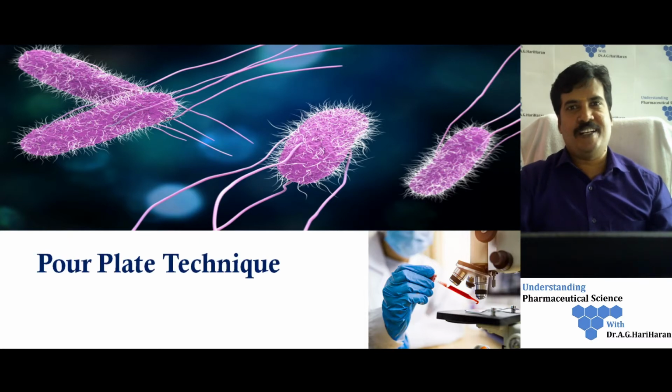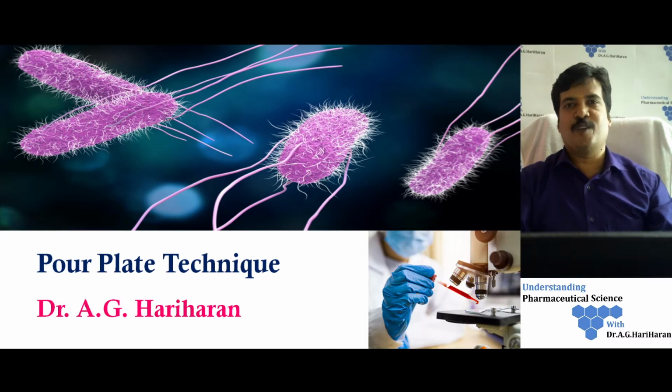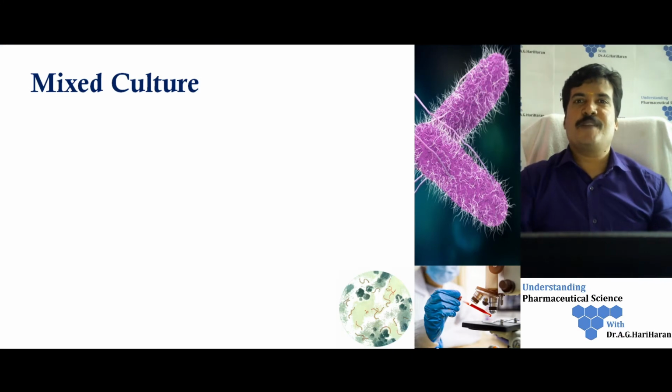So today we are going to discuss one of the isolation of pure culture techniques, that is the pour plate technique. In this lecture, first we will understand what is meant by the isolation of pure culture, and we will elaborately understand the steps involved in the isolation of pure culture using the pour plate technique.